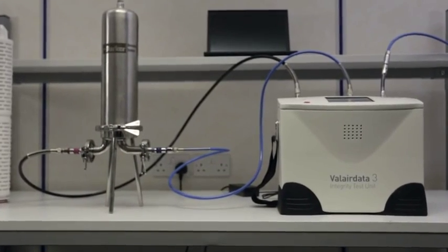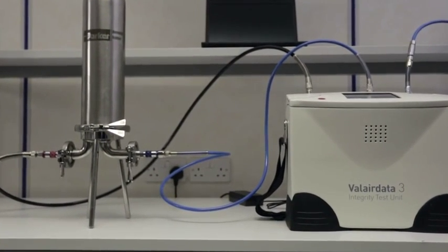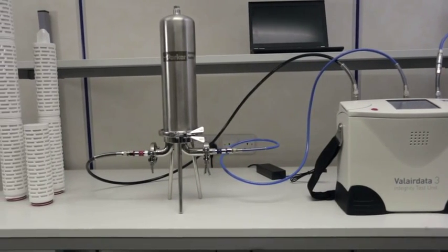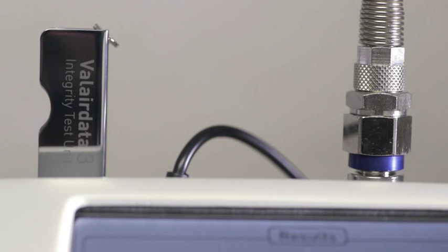The ValairData 3 simulates an aerosol bacterial challenge. During the test, the filter is challenged with a high concentration of aerosol in the size range of 0.1 micrometres to 0.3 micrometres in diameter. The challenge fluid is generated from a safe white mineral oil, FDA-approved for food use.